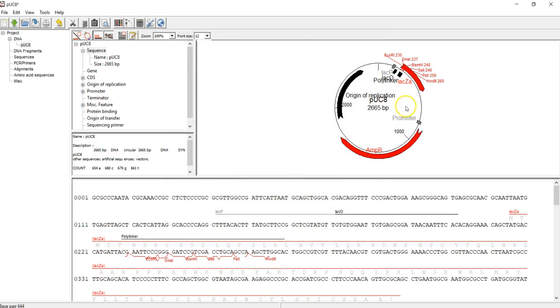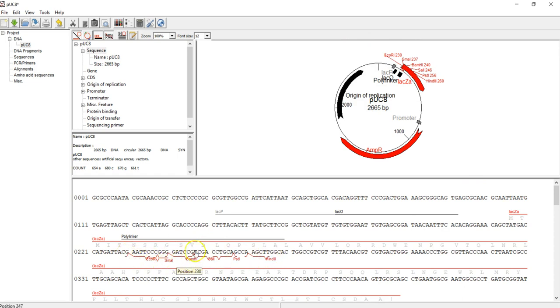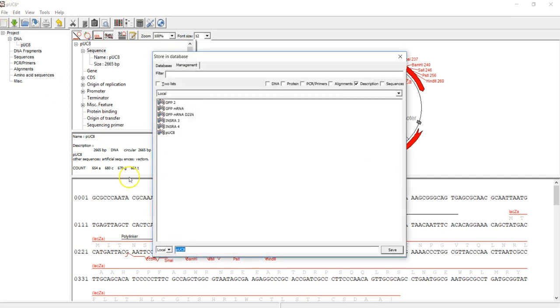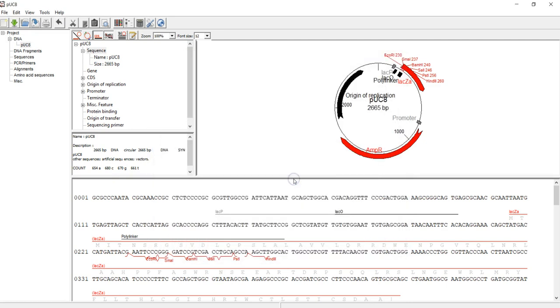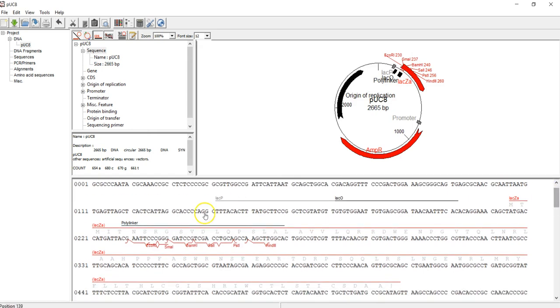Now in this display panel, only this list of restriction enzymes you have chosen will show up. Again, after any modification, you need to save—just Control+S. We did not change the sequence, just added features, so we can override the original file. So let's go back to the sequence panel.